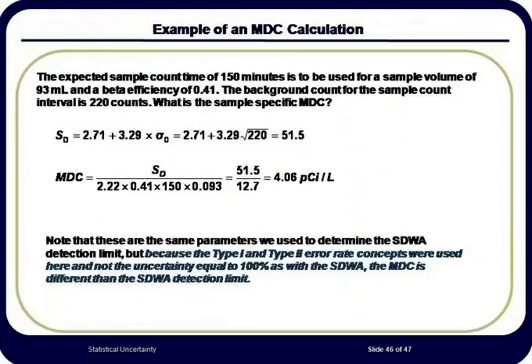The data shown on this slide is the same as that we used for the Safe Drinking Water Act calculation of the required detection limit. The definitions of these detection limits are very different. Thus, we should expect different results.